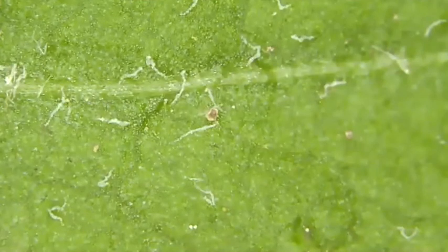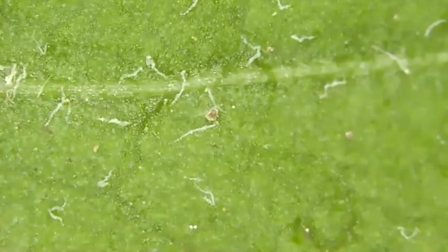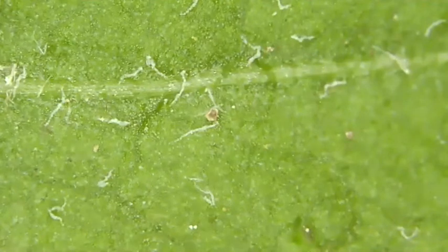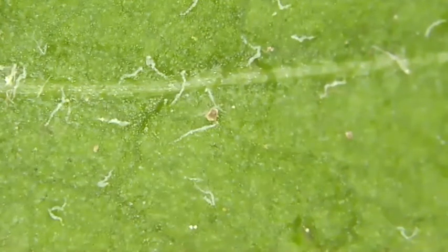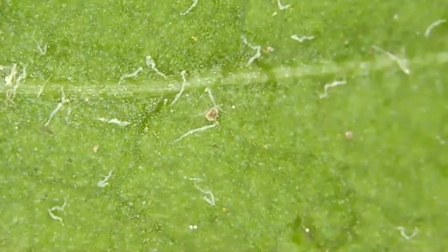Is it a grasshopper? I thought we already established it was a plant. But grasshoppers are green and they do live on it. A bean plant. Sorry, wait. Ani, did you have something? You need to speak up a little bit. I thought it was a bean plant.